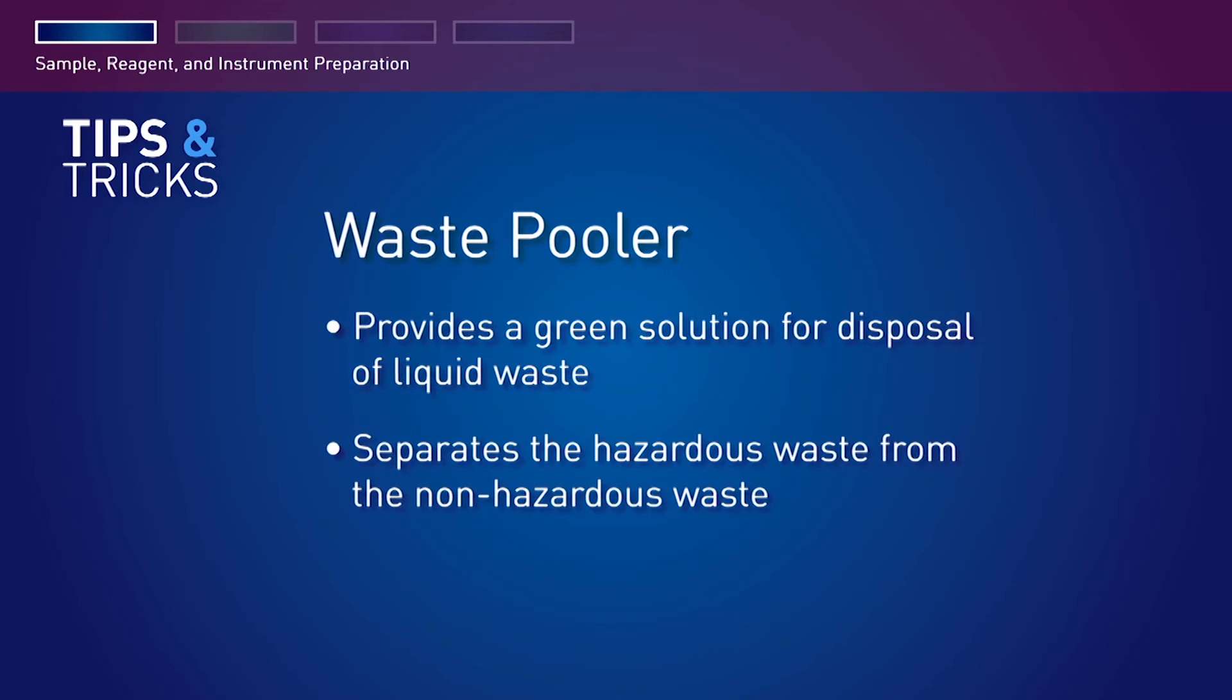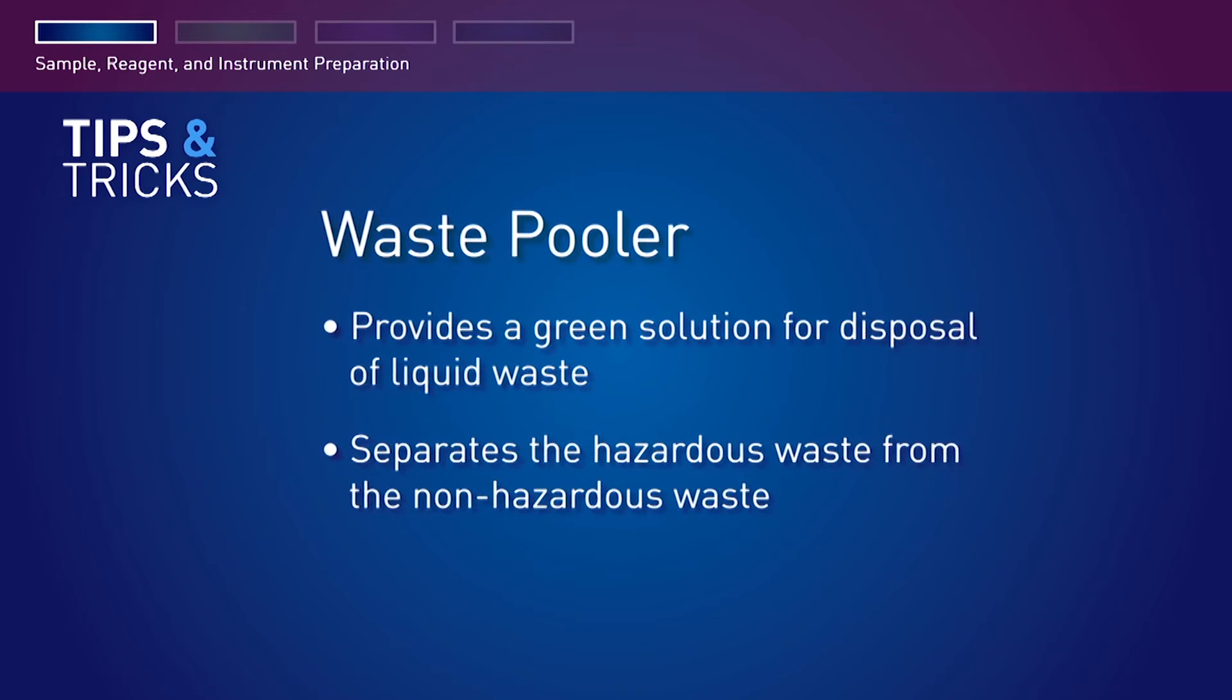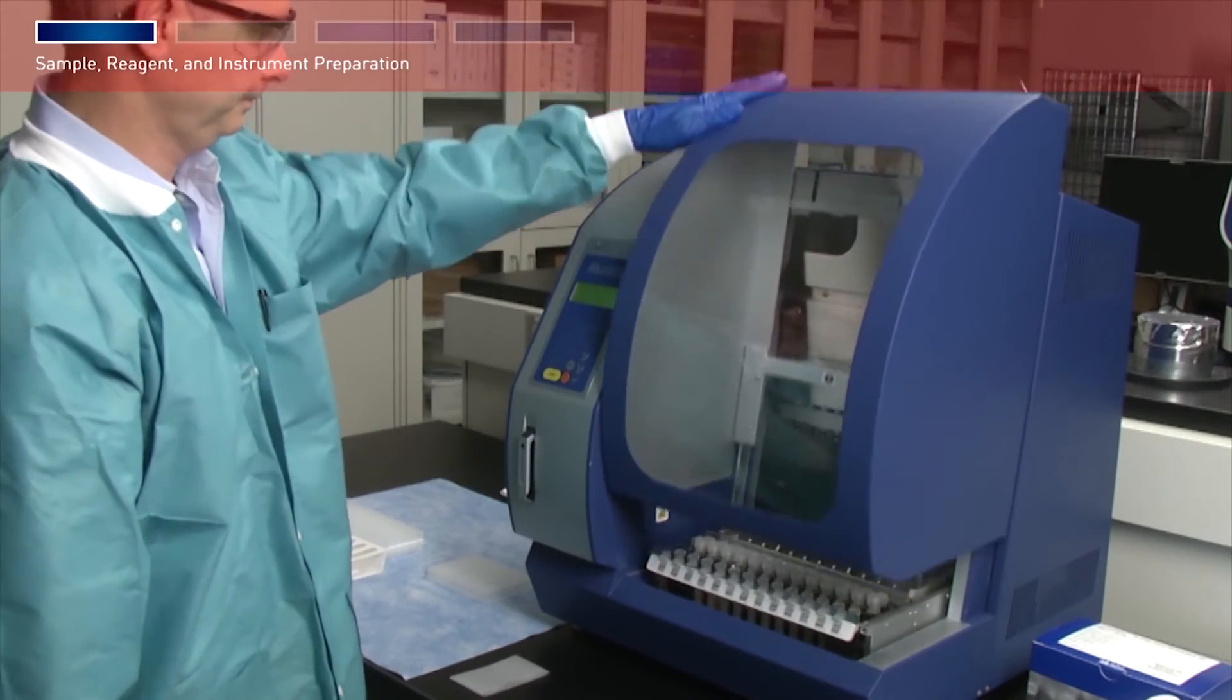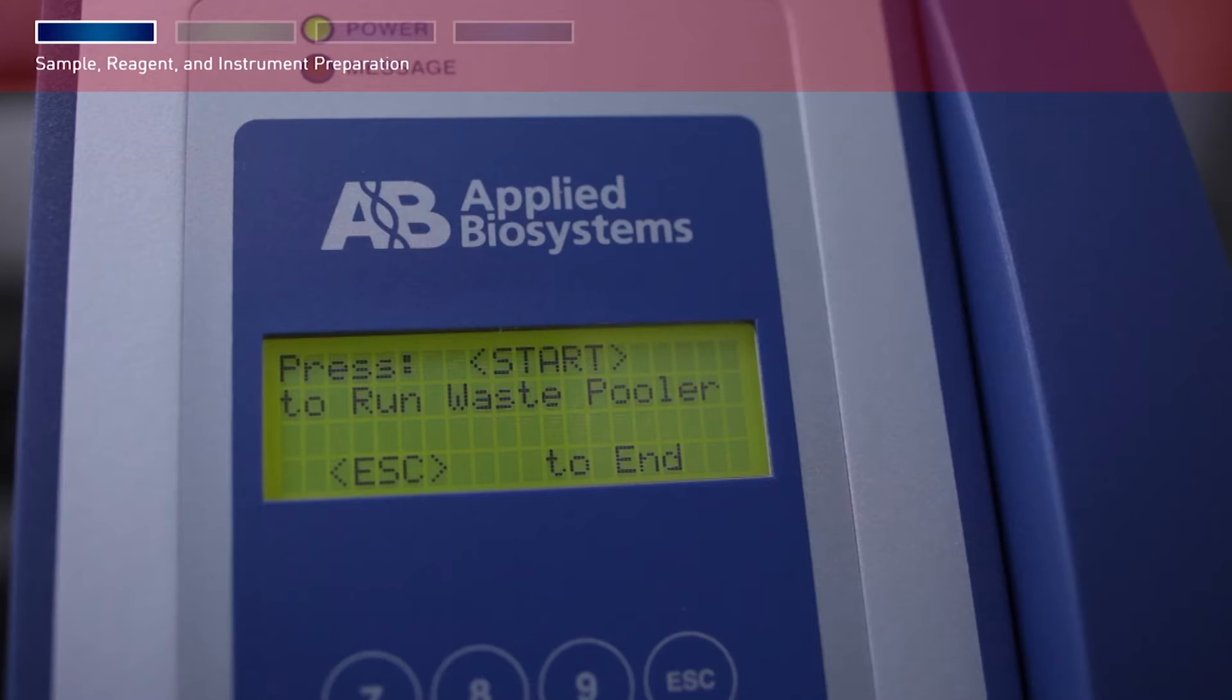The waste pooler provides a green solution for disposal of liquid waste generated from an Automate Express run. The waste pooler separates the hazardous waste from the non-hazardous waste and consolidates it, thereby enabling a safer and easier way to dispose the spent reagents. If you run the waste pooler, close the instrument door then press Start, or press Escape to skip the waste pooler and return to the main menu.